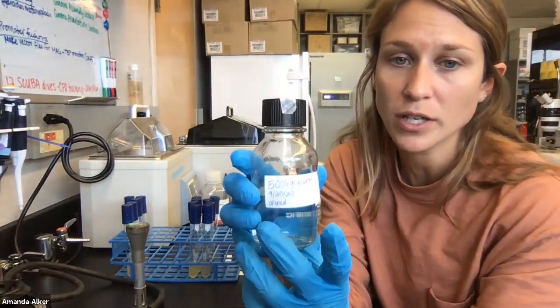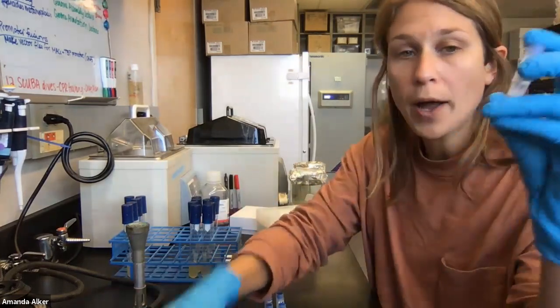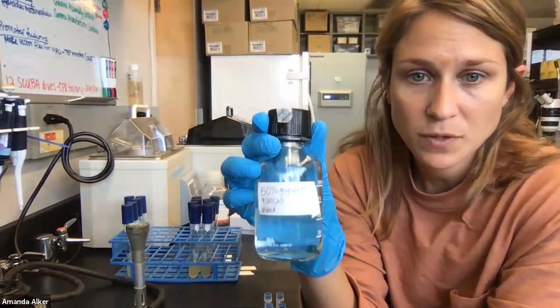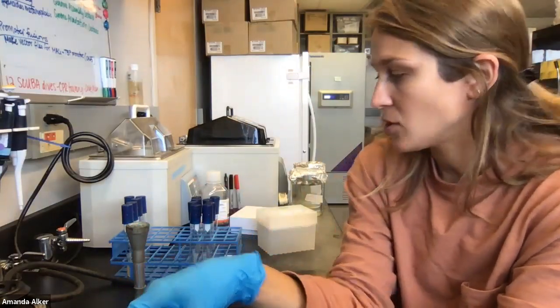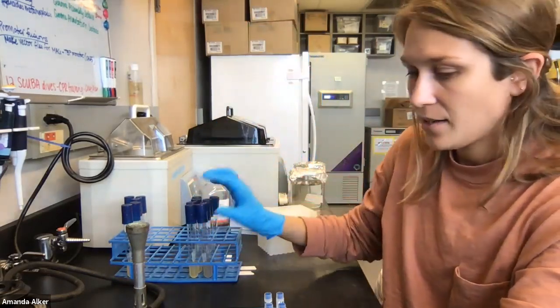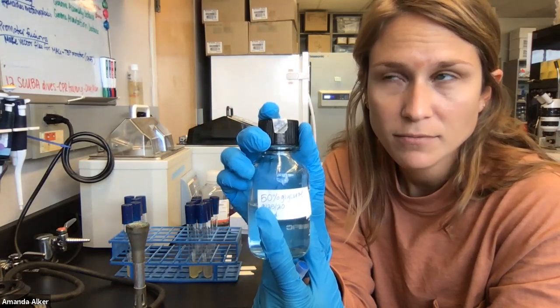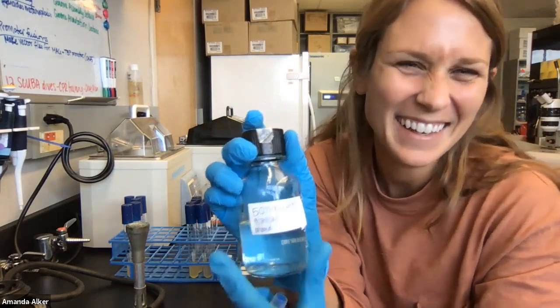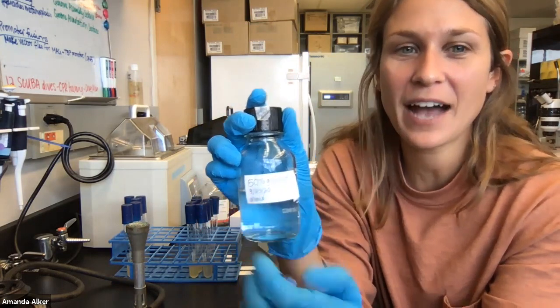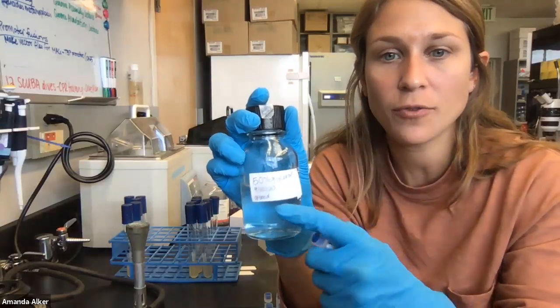The final concentration of glycerol we need is 25%. What we will end up doing is making a 1 mL solution where 500 microliters comes from this 50% glycerol and 500 microliters comes straight from the culture grown overnight from the single colony. So in the end, if you take 50% of 500 microliters in a 1 mL total volume, you get a final concentration of 25% glycerol.